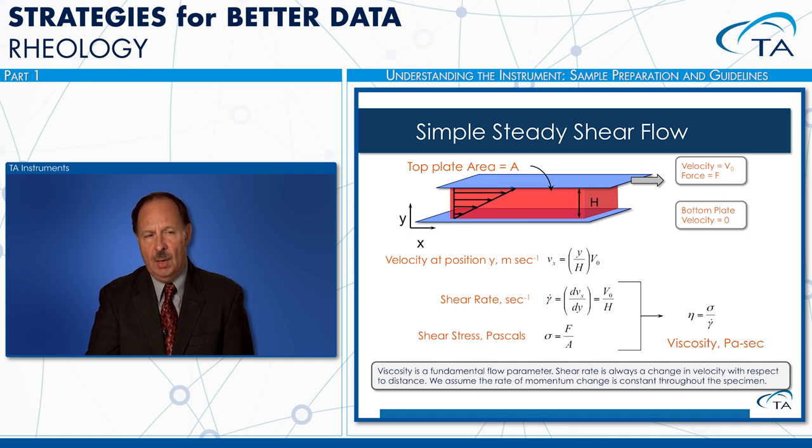There are some operators that still prefer using dynes per square centimeter. But the preferred units are the SI units, which are pascals. If we take the ratio of the shear stress to the shear rate, we get the viscosity of the material.